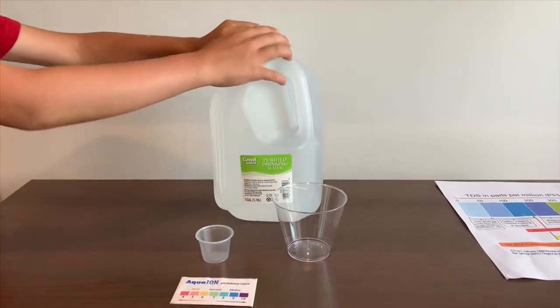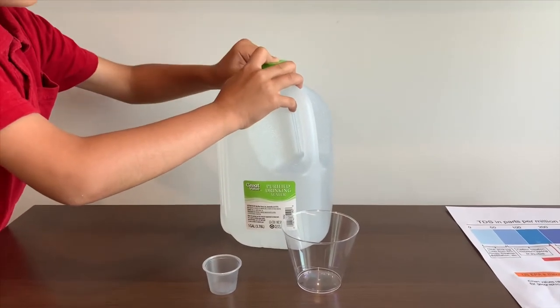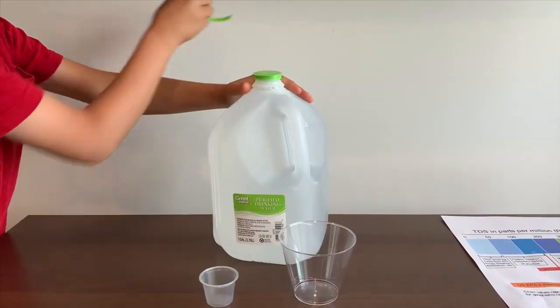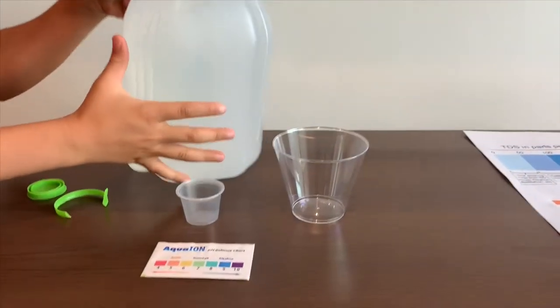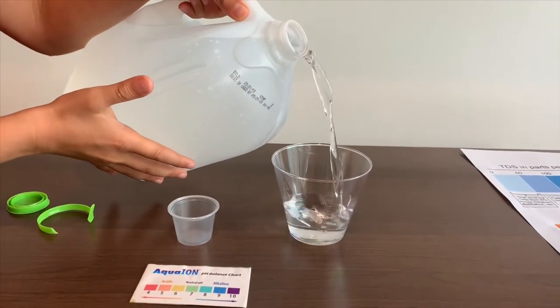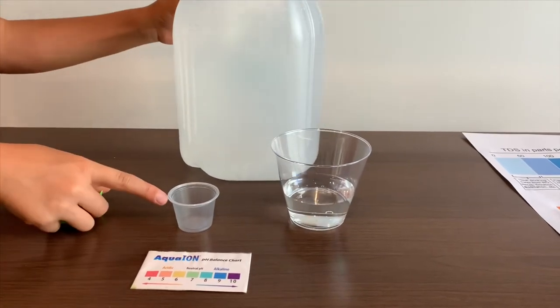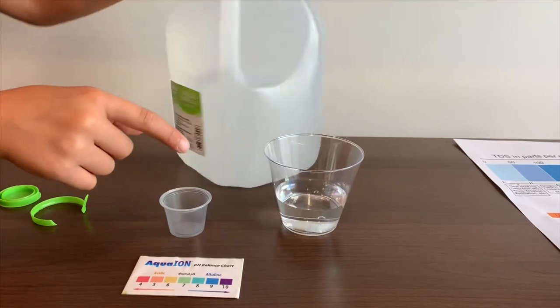Let's test the water in TDS. Let's pour some water in. Since this cup is too big to pour into the pH cup, I'm going to be using the TDS cup to pour into the pH cup.